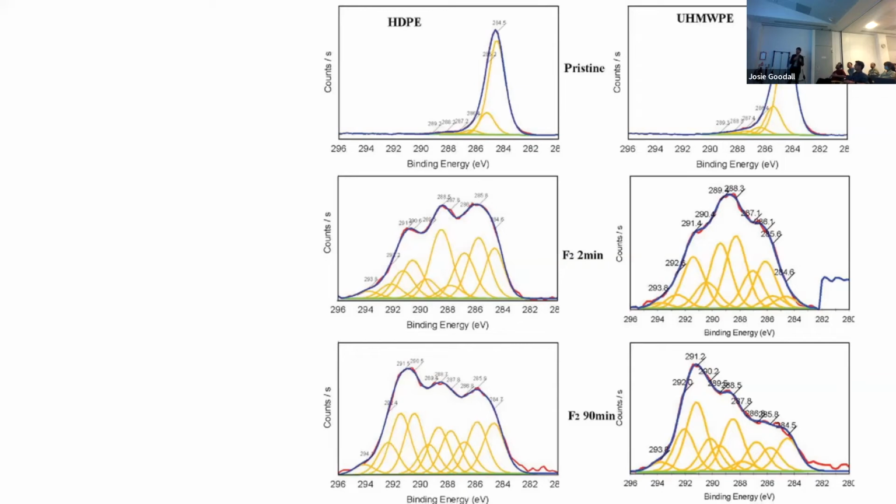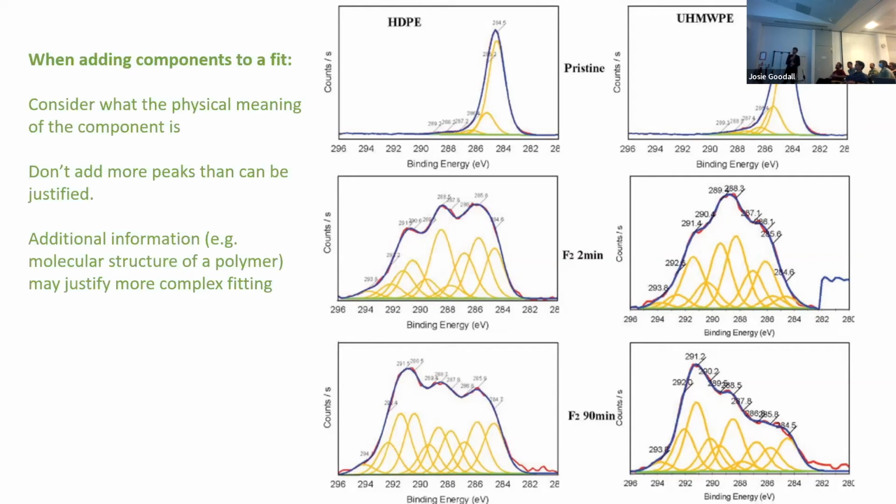What I will say, background looks good. All of our maxima are reasonably similar. But there are many ways you could fit different components for that spectrum. No unique fitting you can get. So it's very difficult to pull out information. There may well be, as I said before, other extra information you can provide from other things, especially in organic materials. That's often a possibility. But in this case, I think we're a bit past that.